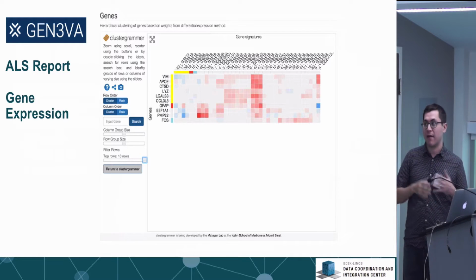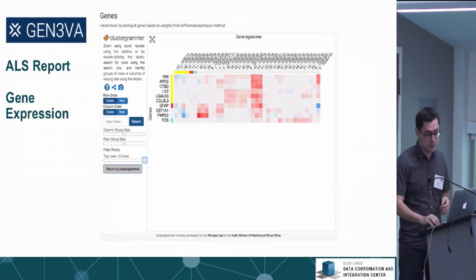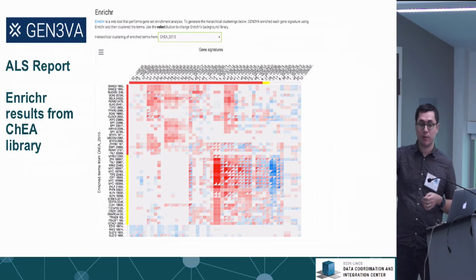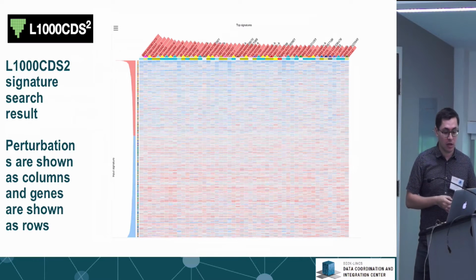So you may have some information that would lead you to want to perhaps test a perturbation based on the specific genes that are involved. And this is just showing you how you can reorder the matrix. For instance, you may not want to choose the top ranked perturbations. You might want to choose perturbations that represent different clusters in your data, perhaps to have the best chance of finding a drug that's going to work for a drug combination.